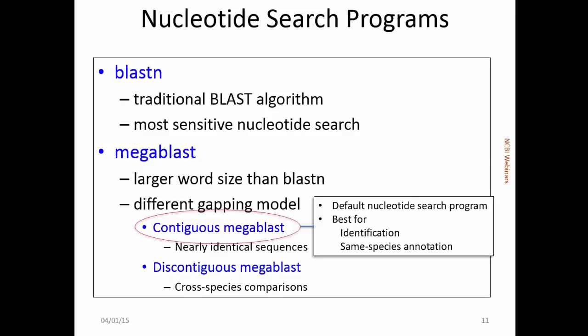So when we come back, when we look at the web pages in a few minutes, you'll see how these things are organized and how you pick the one that you want.